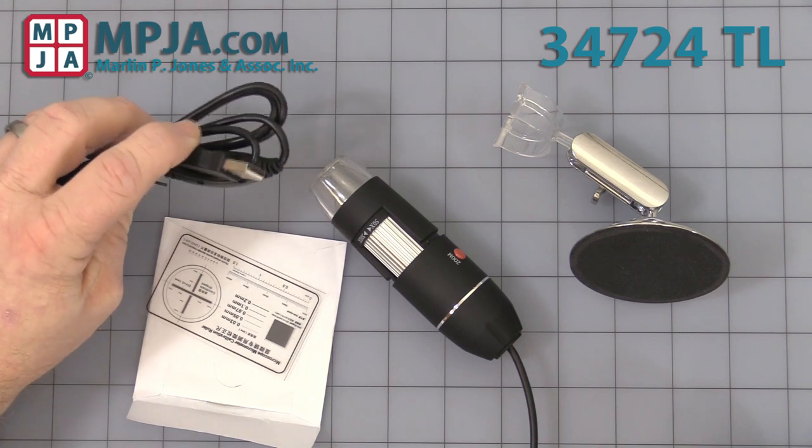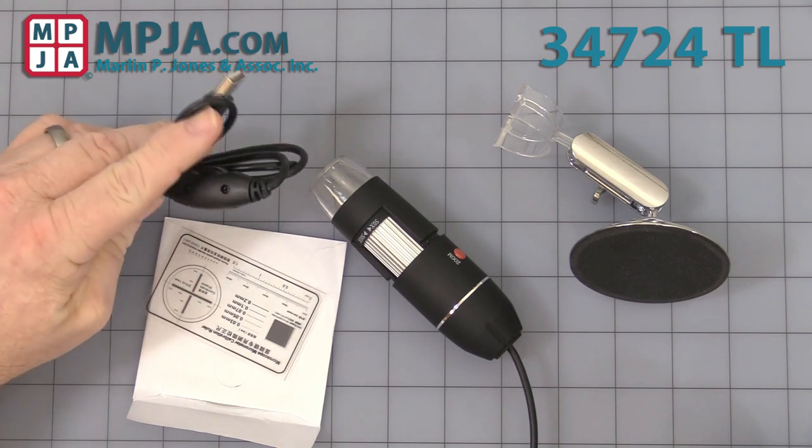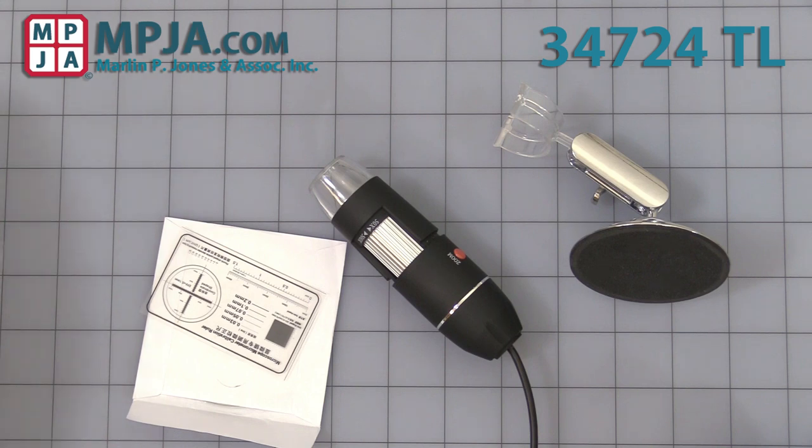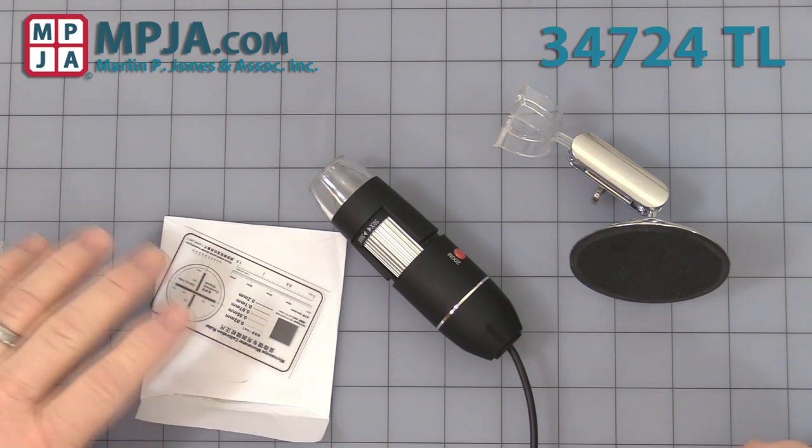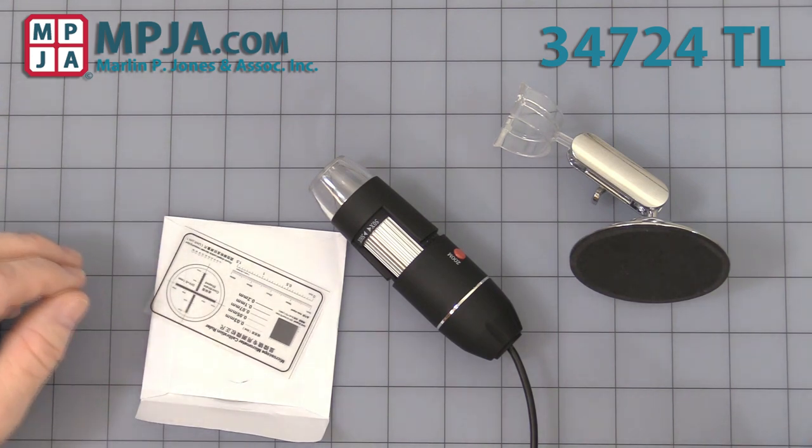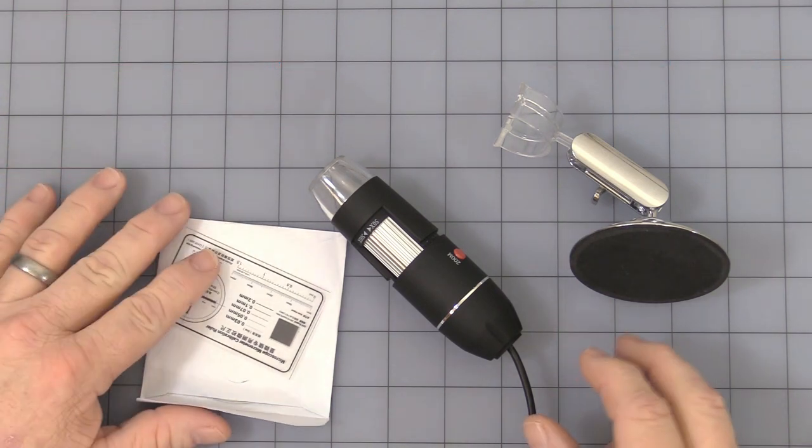It plugs directly into your computer, no other power source is needed. It gets all its power from that. It's 640 by 480 resolution, focal range is about 15 to 40 millimeters depending on the magnification.